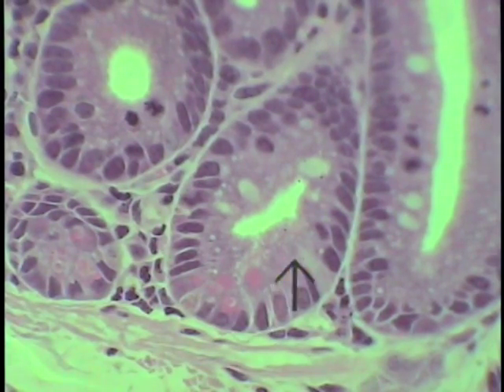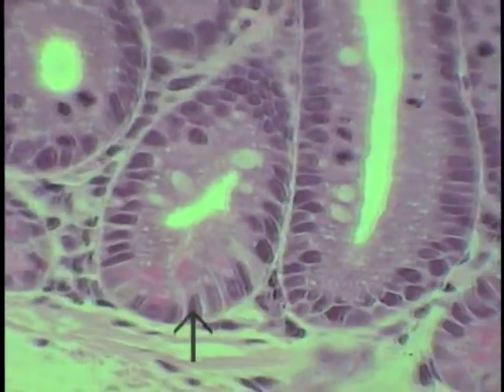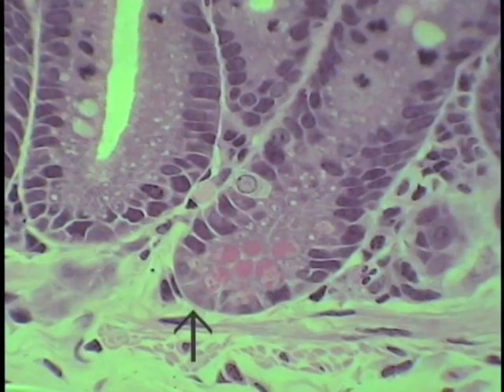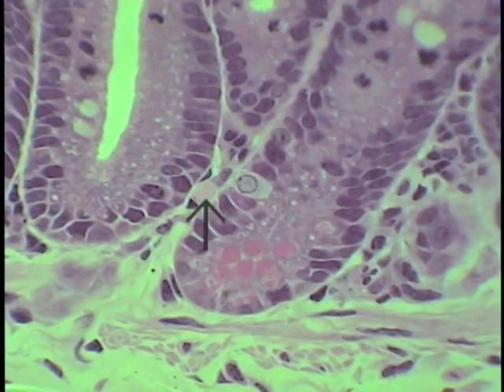Paneth cells. They're always found right at the very base of the crypts of Lieberkuhn or the intestinal glands, and then tucked in with them is a small enteroendocrine cell as well. Another example of some of these Paneth cells shown here, as well as quite clearly one can see an enteroendocrine cell at the tip of the pointer. If one looks very carefully at the base, you can see its secretory granules are accumulating basally because its secretion is going to go in this direction, probably to this capillary, which is right here. You can see the little red cell within it.